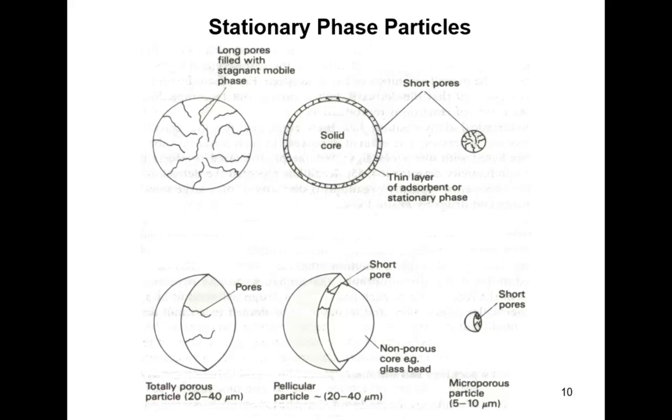Then the better solution was to find, I'm not sure exactly how they achieved this, better manufacturing processes which give you smaller particles, down from about 20 microns to 5 microns or less. For one thing, we're increasing the overall surface area of the silica for the same mass of material. And we're also reducing the size of these pores, so it reduces this extra diffusion process, which gives rise to broadening of the peaks.